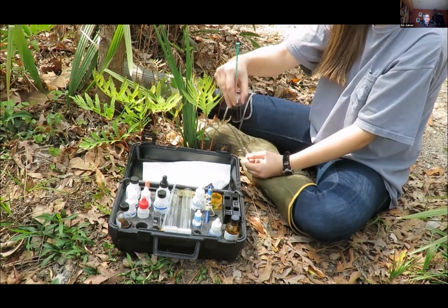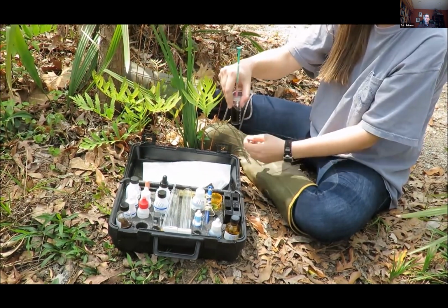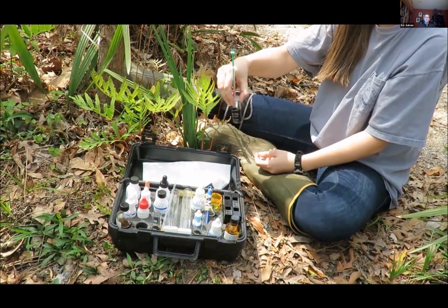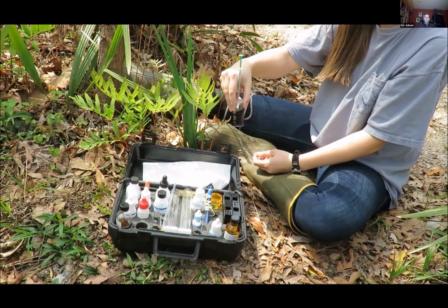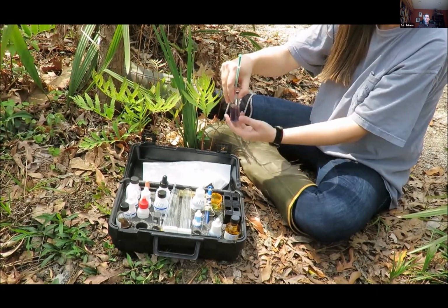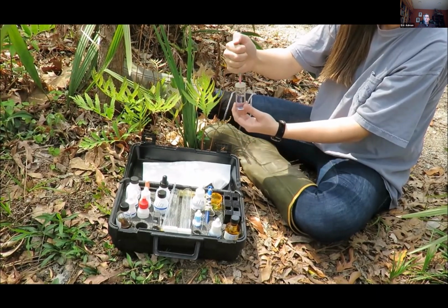During the titration, if the plunger tip reaches the bottom line on the titrator scale before the solution is clear, refill the titrator to the 0 line with sodium thiosulfate and continue the titration. If you have to refill, be sure to add 10 parts per million to your second parts per million value and record the total value required for the titration.